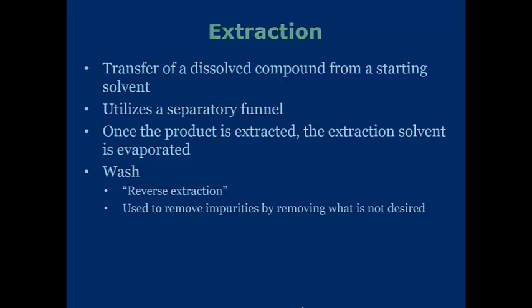A wash, on the other hand, is a reverse extraction. This is used to remove impurities by removing what is not desired. If you don't remember what a separatory funnel looks like, it looks something like this.